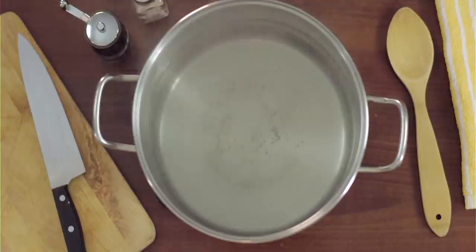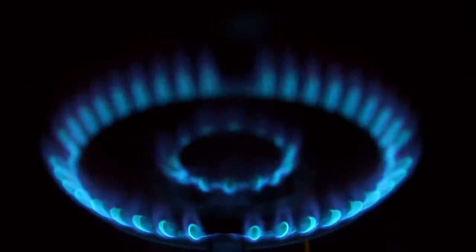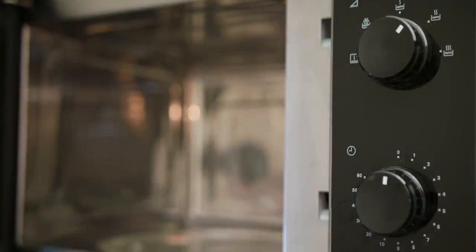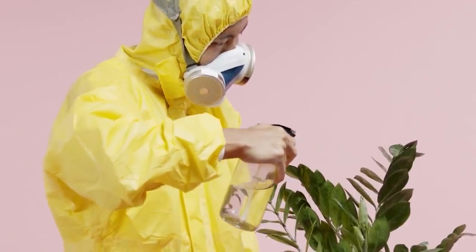Now then, tissue culture is usually performed by large companies, large corporations, but there are a subset of people, hobbyists, that do like to try and perform tissue culture at home. This process is often referred to as kitchen culture because, as you may suspect, a lot of this protocol is actually carried out in a kitchen environment using kitchen materials. So think of it as kind of like the Breaking Bad of tissue culture. That's what's kind of going on at the minute.